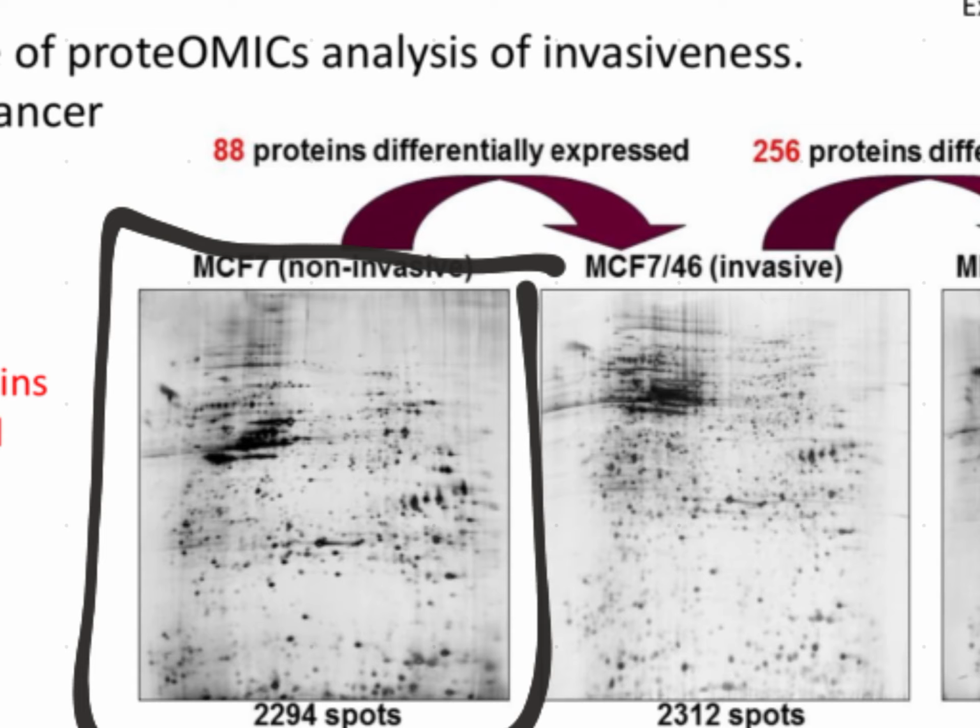And what the robotic station is trying to do is separate all the proteins in the sample into those teeny tiny spots without losing some of the proteins. So maybe imagine separating sugar and salt from each other. You're bound to miss a few bits here and there, but this is tech. It doesn't go wrong. So it's going to separate everything and give you the right number of protein spots in a sense. Just like in the image here. You got a lot of teeny tiny spots all around.